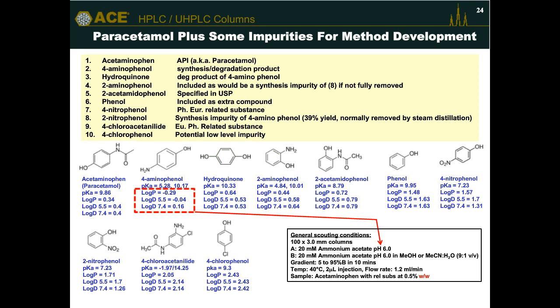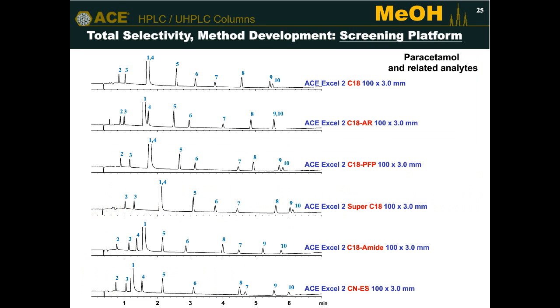One sheet of paper has 6 chromatograms in methanol, and one has 6 chromatograms in acetonitrile. And there's a simple stack plot, we can very simply assess the data to see what we need to do next. And that's the data I'm going to share with you today from the instrument. So we've performed the analysis, and these are the data in methanol.